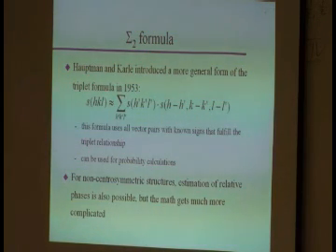So they basically said that they should make use of all of these reflections that fulfill that, because if we are talking probability, the more reflections you look at, the better your chances of being right. Okay? And that is what they introduced. So this is the Hauptmann and Karle sum formula for triplets. And they actually won a Nobel Prize for their contributions to crystallography.